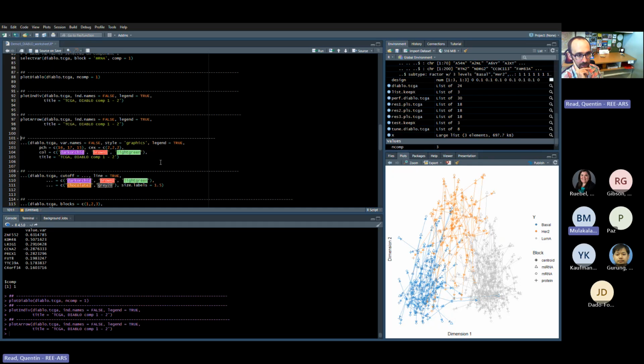Well, maybe there was some missing data. Like some samples only had some of the omics? But when we block with mRNA, I see like 10 samples. But when we block with protein, I see maybe 4. There is no equal number of samples.